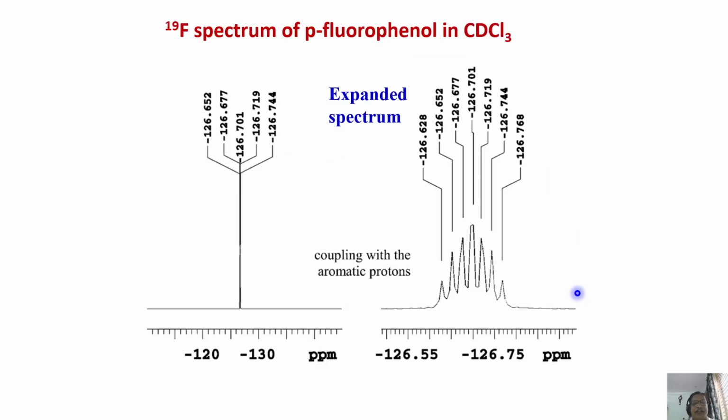now we'll try to analyze some of the spectra of different nuclei. I wanted to make you understand heteronuclear NMR. Extensively, I have covered carbon, proton, everything. That is more than sufficient for you because with that knowledge you can analyze. But some tricky situations will be there, like we saw isotope shift, or varieties of other things will come. Some of these problems we come across once in a while. So let us see some of the spectra other than proton and carbon, some heteronuclear spectra.